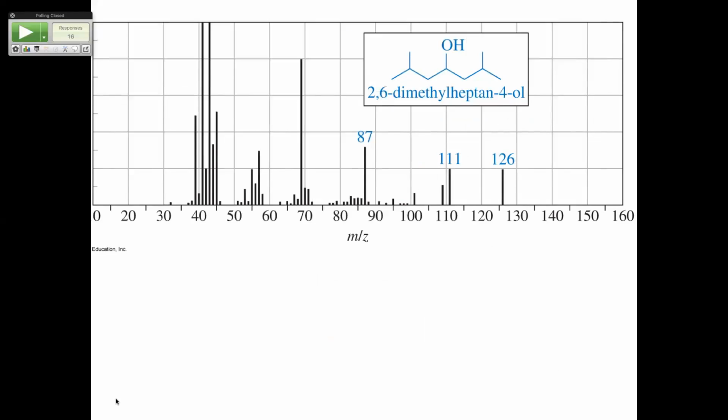Okay, so notice, what are the biggest peaks? Look, we got 2. So what do you think they are? The number is right under the one that stands for it, I think. I'm scared to touch it. 41, 42, 43. So this one over here is 43, I think. You literally just count across. When you get it off of a mass spec, it typically will give you a printout with the picture that looks like that, and then underneath it will be a table of all of the little numbers. So what do you think 43 is off of this?